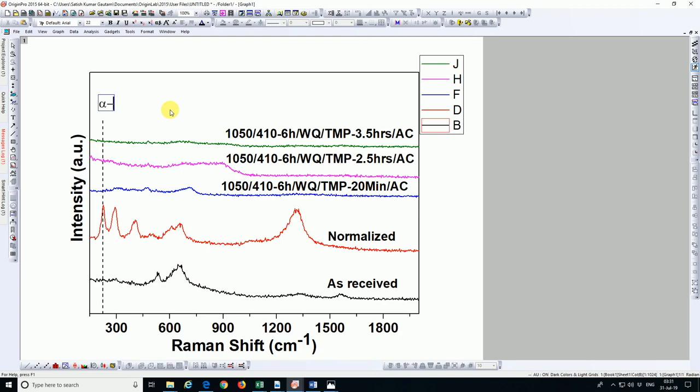Now I am writing Fe2O3, Fe. Now take the subscript, press the subscript button here, it will go down, Fe2, again click it. I want to write O, again click it, 3, again click it. Select the entire text, and make it bold.